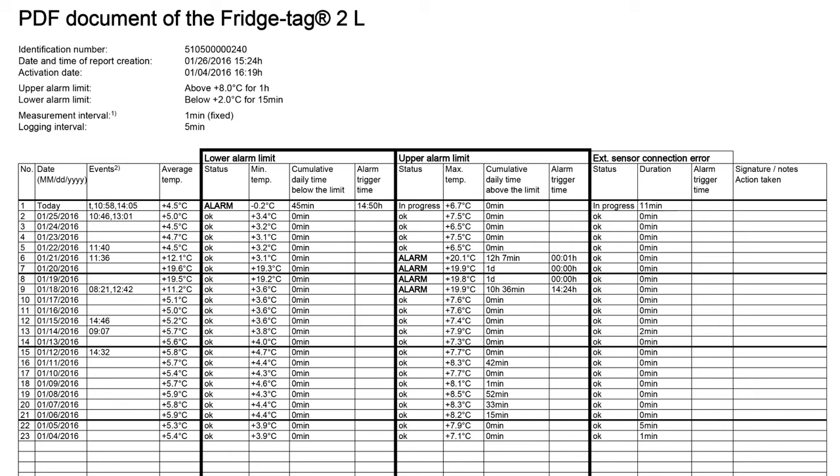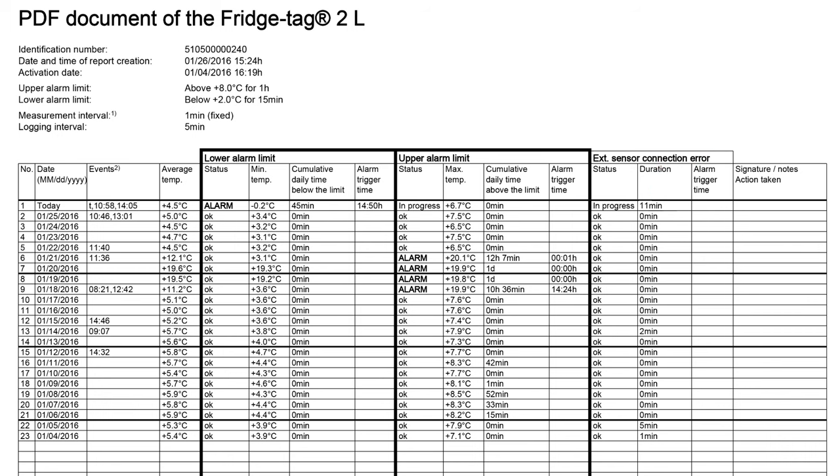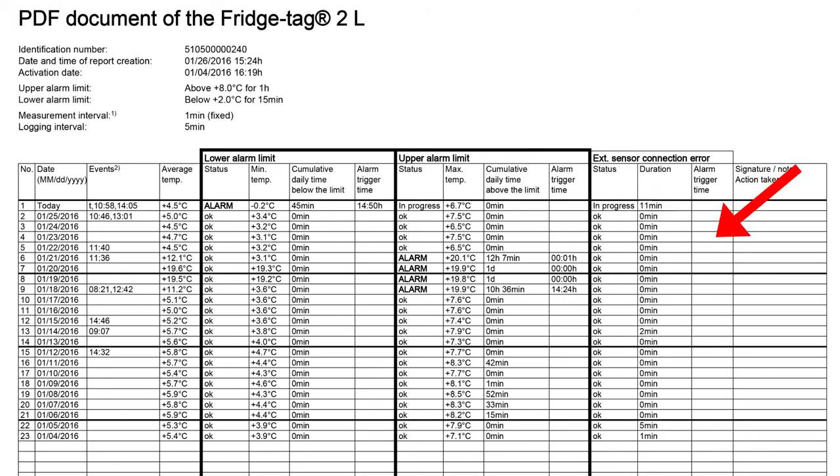The far right-hand side shows how long the external sensor was disconnected from the data logger, and we can see that it was 11 minutes today while we were generating the report. If it is disconnected for more than 15 minutes, the OK will change to an alarm. It will tell you the total duration it's disconnected and the time that the alarm was triggered.